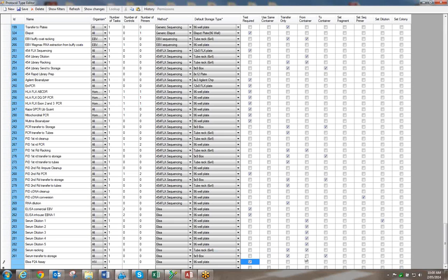But you can refer to some previous protocols where these things have been ticked, and that will give you an idea of what this gives, if it's going to be of any help. But this doesn't stop you from running the protocol in any way. So if you don't untick it and later go on down and tick it, it will help you or not, but it doesn't stop you from creating the protocols in any way.